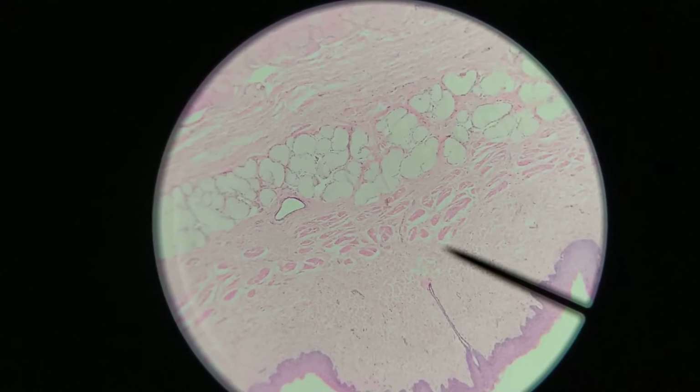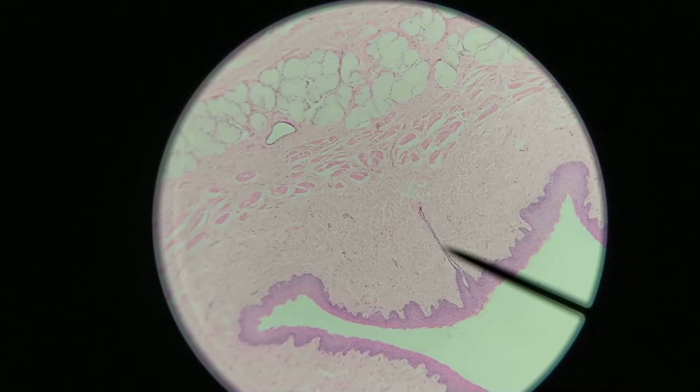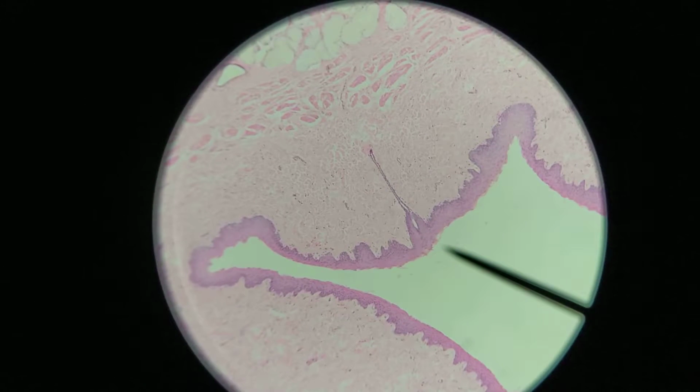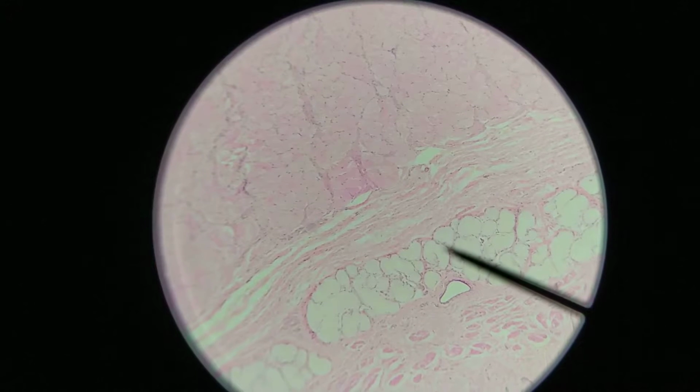These glands produce the mucus, which will travel to the surface. So you can see one of these ducts leading up to the surface right here. Okay, and so that lubricates the surface of the esophagus so that when you're swallowing your food, it helps the food move along smoothly. Okay, so these are mucus glands, which is why they're very poorly stained. As you will see, basically these are glands filled with cells that look very much like goblet cells, and you will see that the glands have a fairly wide open lumen, so these are mucus glands.